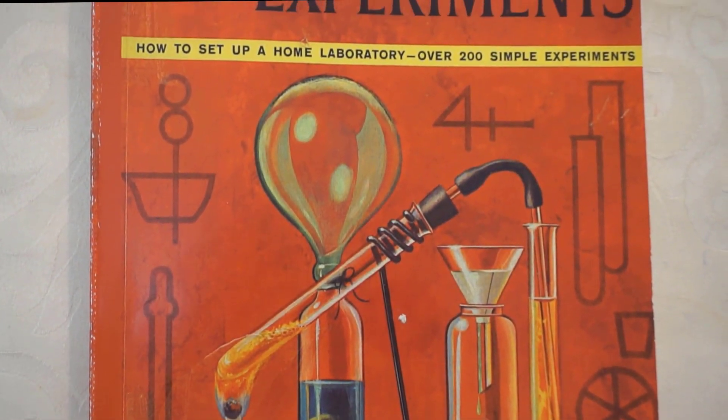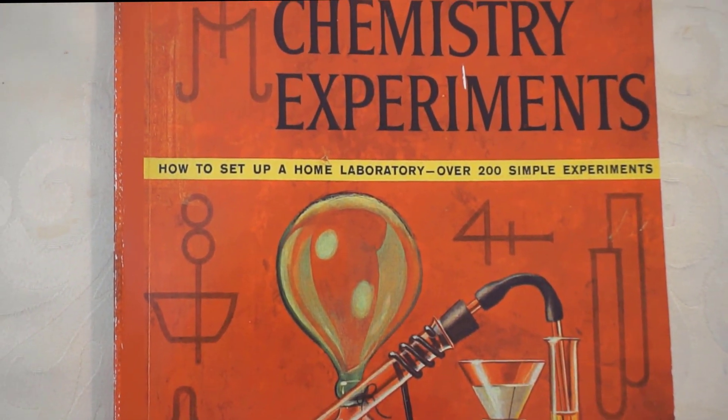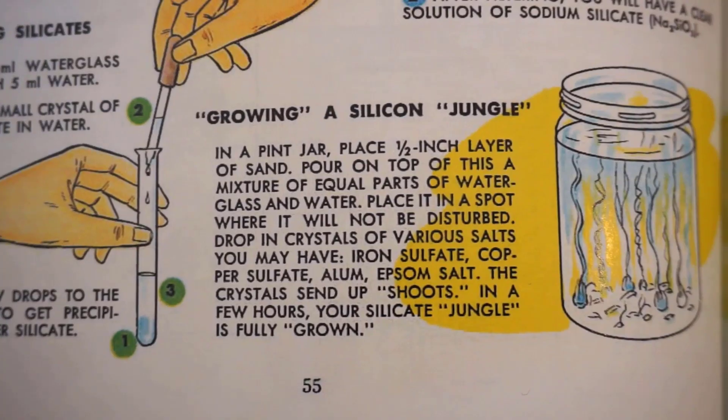Looking up to one of the classic chemistry experiments books, I stumbled upon the chemical jungle experiment.